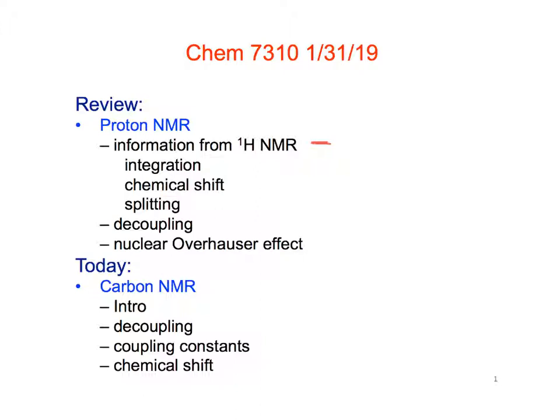Yeah. We looked at integration, chemical shifts, splitting. We talked about some decoupling experiments last time, nuclear Overhauser effect.